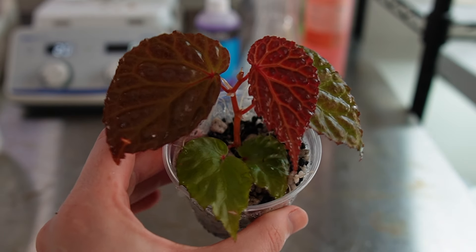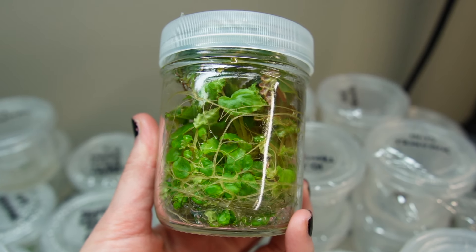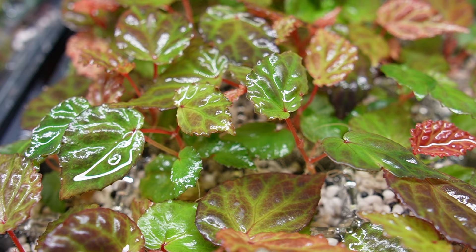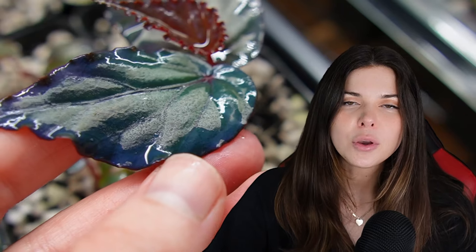Hello friends and enemies. In part one of this video I want to show you the exact method, including the protocol that I follow for successfully tissue culturing begonias at home. And in part two I'll do a pecha kucha style show and tell of my begonia collection and talk about how I care for them.